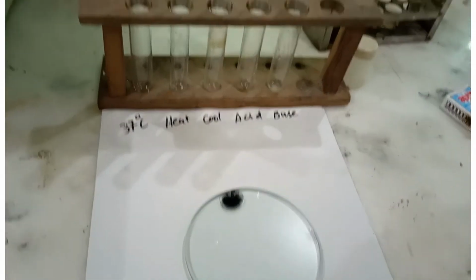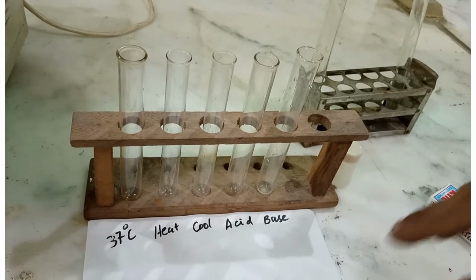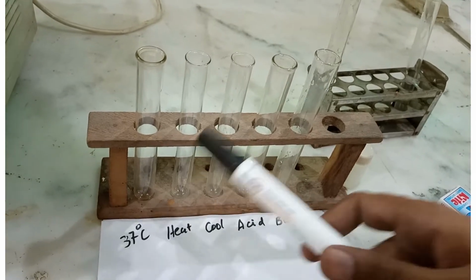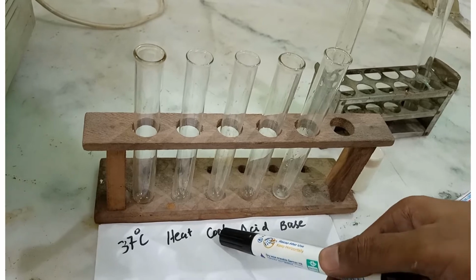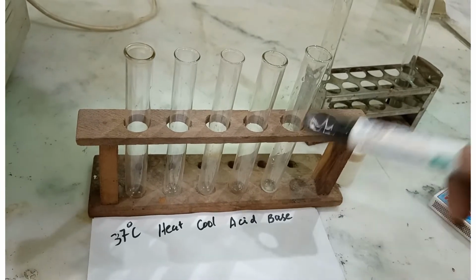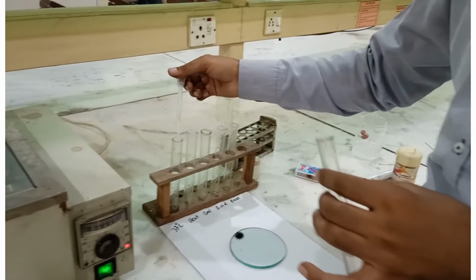After the iodine test, now we are going to use these 5 tubes for our experiment. We'll keep one test tube at 37 degrees centigrade. We'll heat one tube. We will keep one tube in a refrigerator or freezer, and in another tube we will put acid, and in the last tube we will put a base. Add 1 ml of saliva solution into all the tubes.